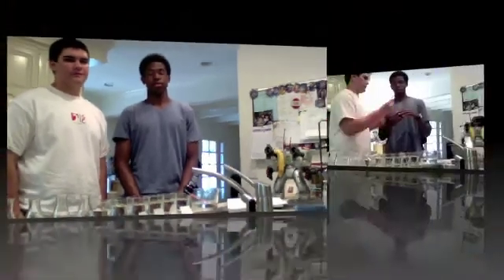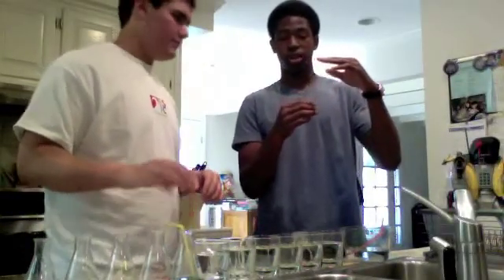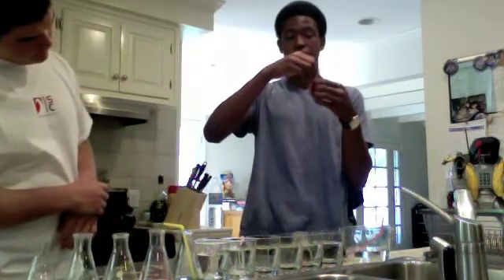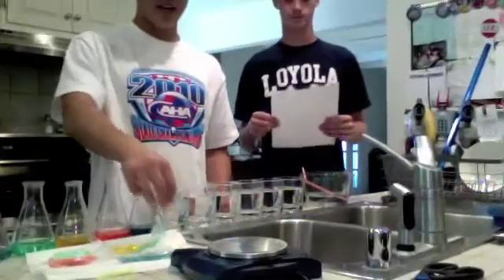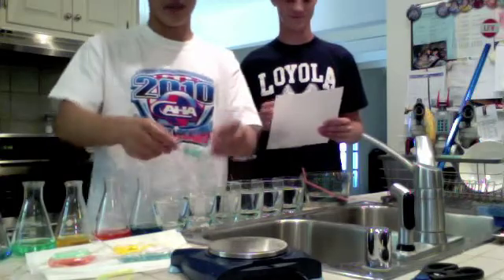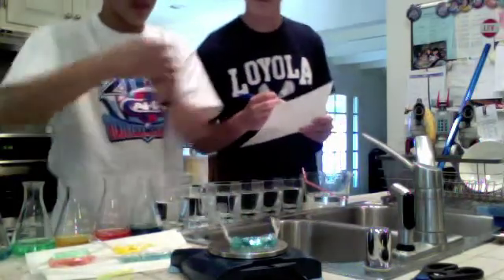The independent variable for our experiment is the concentration of sucrose. The dependent variable is the percent change in mass of the dialysis bag. Now that the bag has been filled, you must remove most of the air with your fingers and then tie the bag, leaving a little room for expansion. Now, after rinsing and drying each of these bags, we place them on the scale to get the initial mass and then record it.